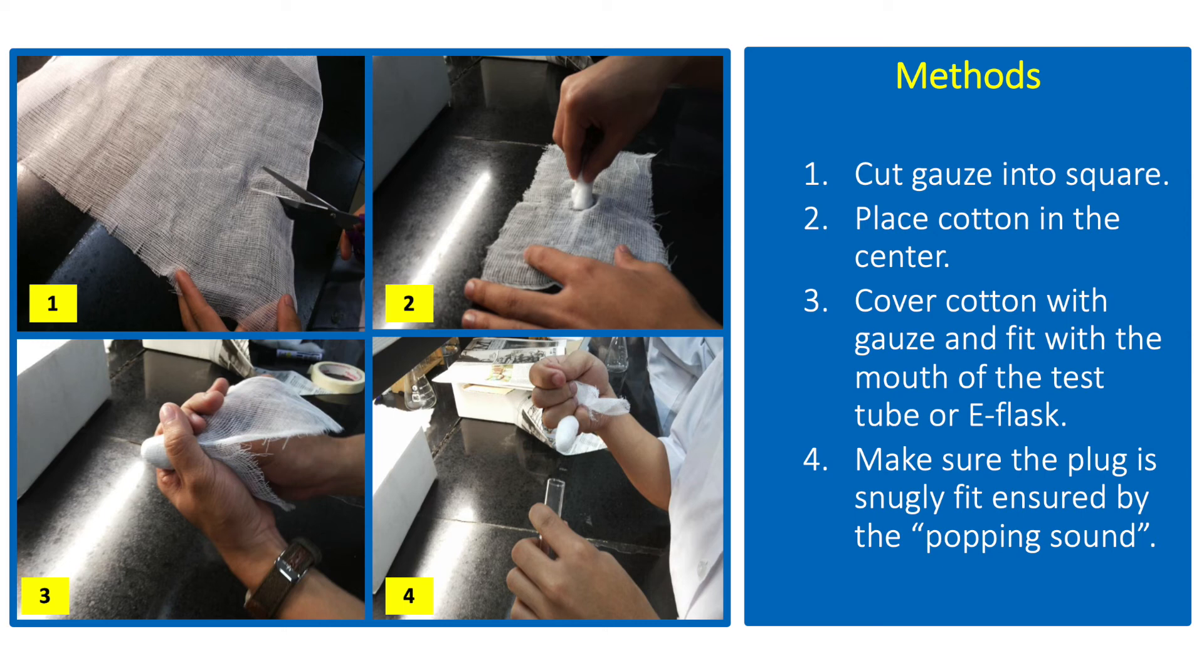The plug must have a snug fit, not too tight that it will cause the tube to break, or not too loose that it will fall easily. To ensure this, you can refill the amount of the cotton until it makes a popping sound once pulled from the test tube or flask.